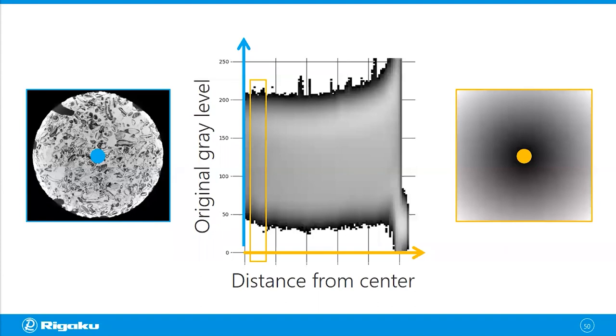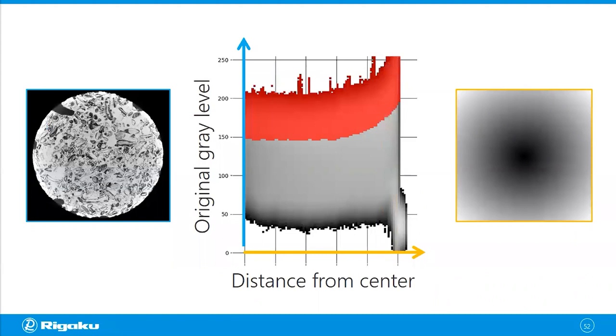Now we're going to go back to the distance map and look at the edge area, which is bright. Now we're looking at voxels in this area. And we're going to jump back to the original image again and set another threshold that works just for that edge area. In the same manner, you can set a threshold for different locations of the original image. And at the end, you will have those voxels selected and you can map this back to the original image.